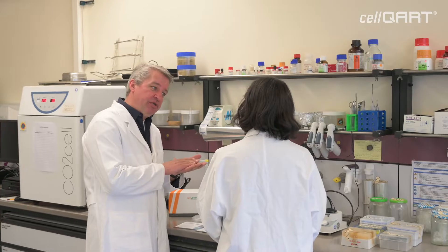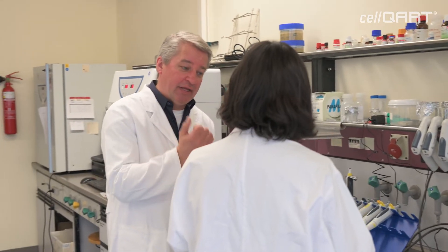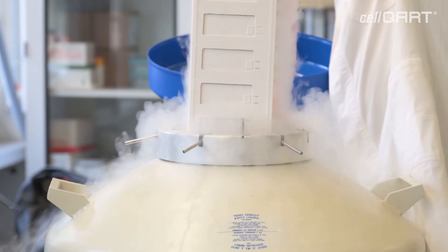My name is Joachim Wegener. I'm a professor for bioanalysis here at Regensburg University, and our lab is interested in developing new devices and new assays to monitor living cells in culture.